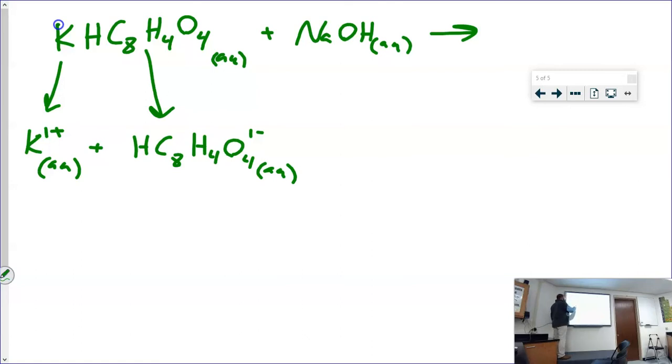The hydrogen from this chunk is the acid. Do you see that first hydrogen written out front? Kind of like I described to you in Thursday's class. When you have a hydrogen out front, that means it's an acidic compound. So here's my acidic hydrogen out front. The rest of this will be left over. This hydrogen will react with the hydroxide from the sodium hydroxide.